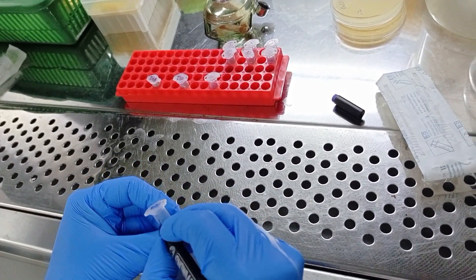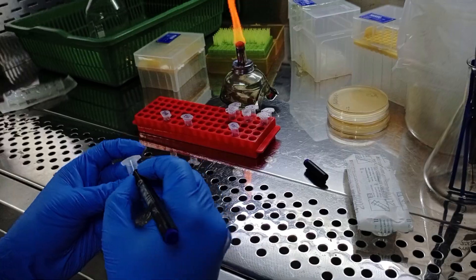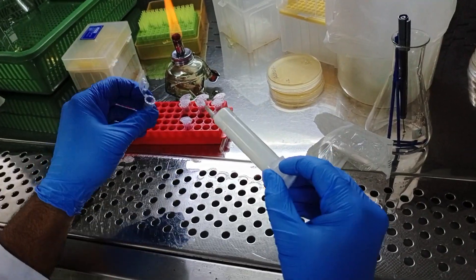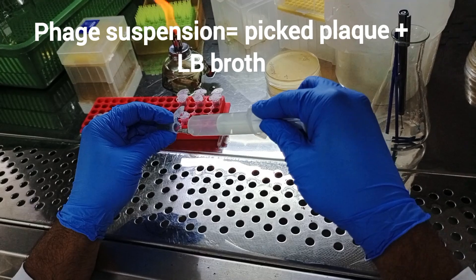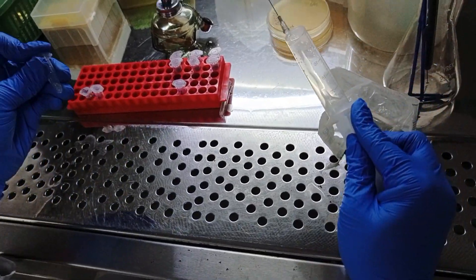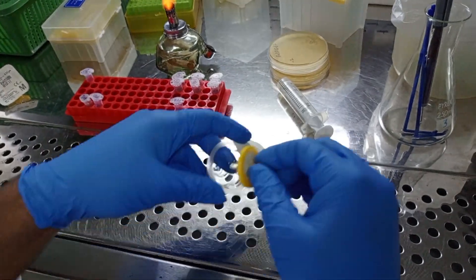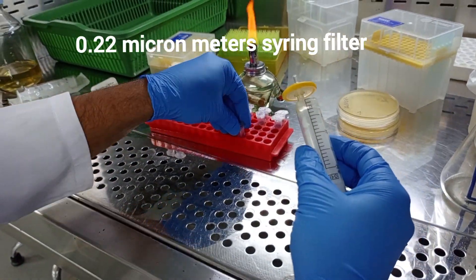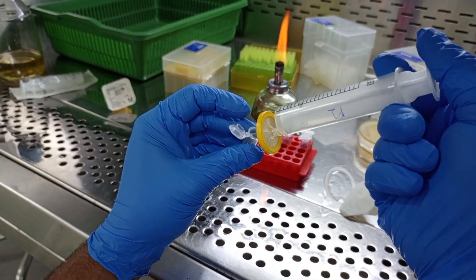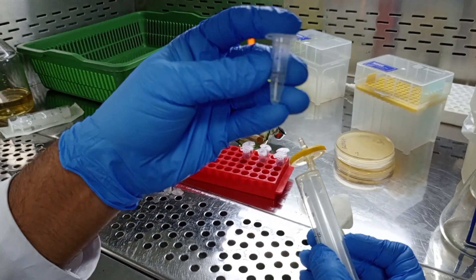Now we have to filter this suspension with a 0.22 µm syringe filter. For that, take two new eppendorfs, label them appropriately, and take the syringe. Fill the syringe with the phage suspension — the plaque plus LB broth — and filter this suspension into a newly labeled eppendorf. It's better to use a wet syringe filter, so you can pass LB broth through the filter before filtering the suspension. Use a new syringe and new syringe filter for each different phage suspension.